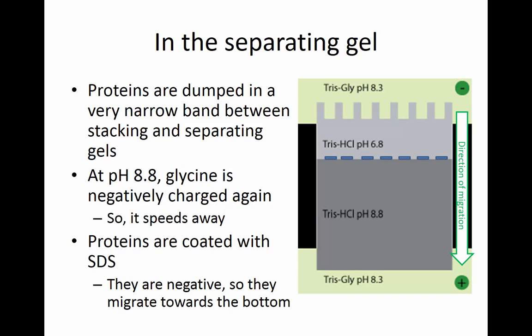And then they're going to hit the separating gel. The proteins will be dumped in a very narrow band between the stacking and separating gels. So basically none of the proteins will really and truly have what we would say is a head start in getting into the separating gel.